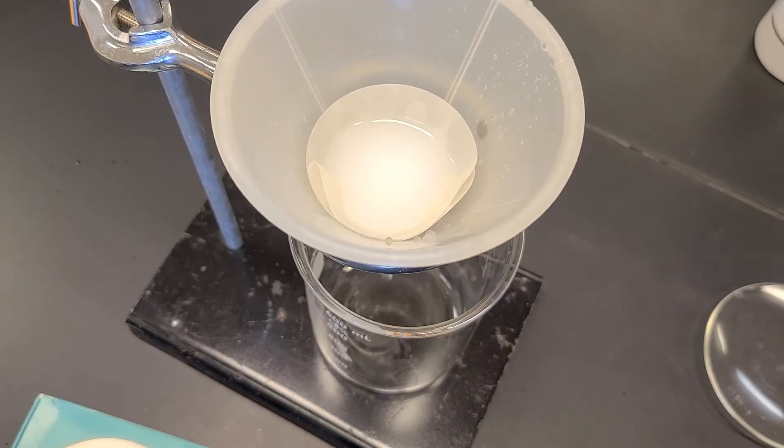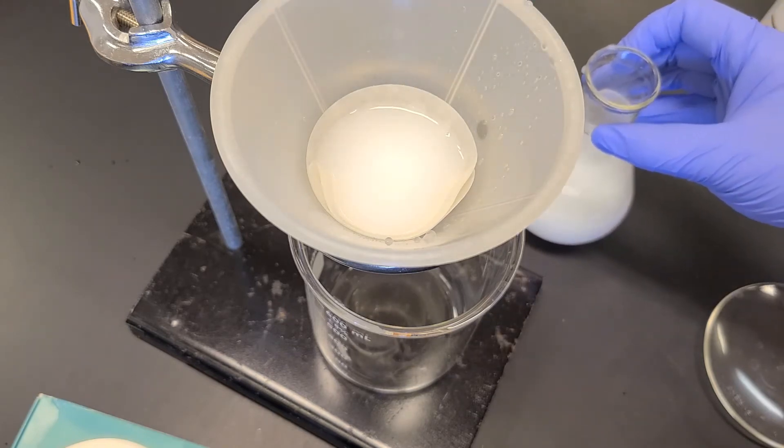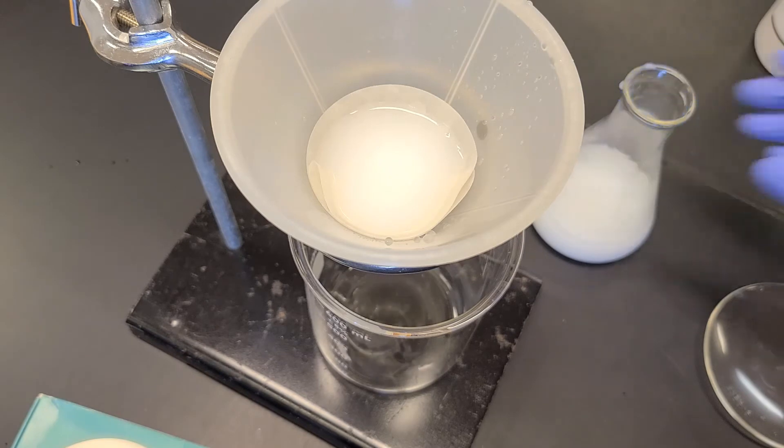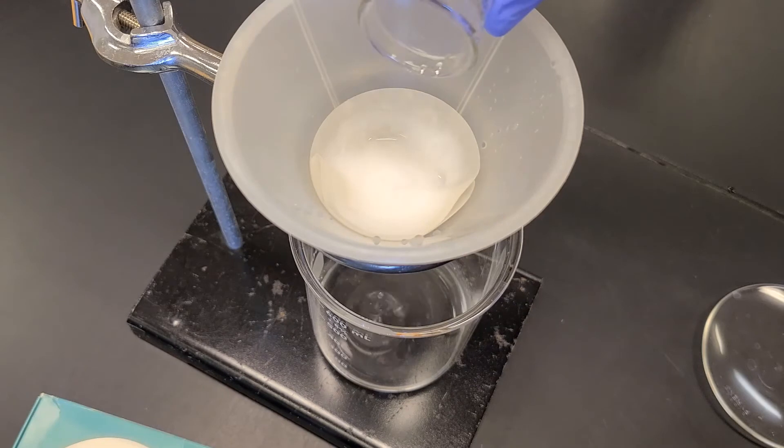We always want to make sure that the sample is entirely within the filter paper. I can just go ahead and keep adding and filtering until my solution is all gone, all filtered through. We're going to keep doing this until we don't have any more solution left.